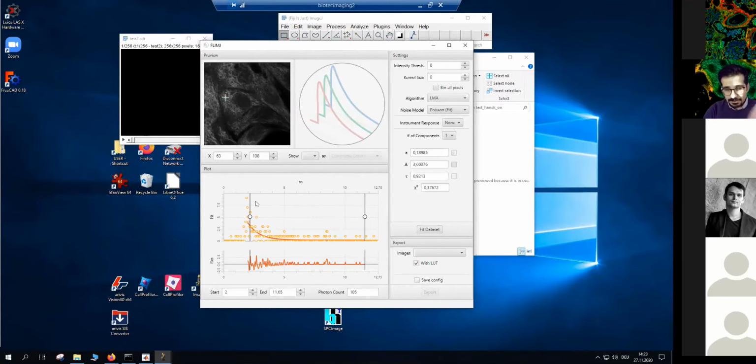This is usually what we get with many software, in many cases. Yes, Thomas is also right that sometimes with different versions of Fiji, we get errors, so we need to check which version we are using. And yeah, here we are.